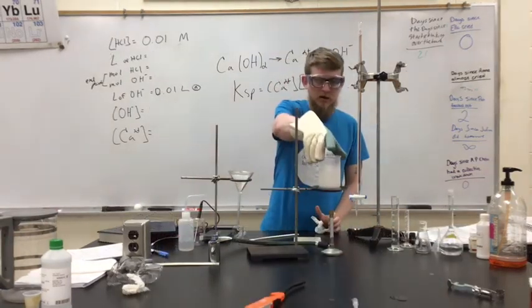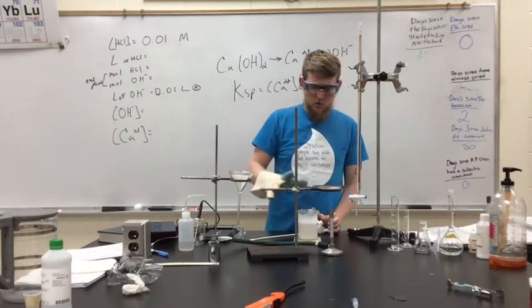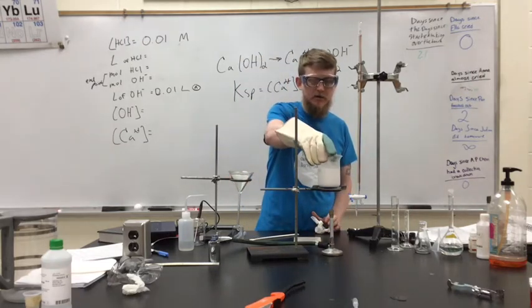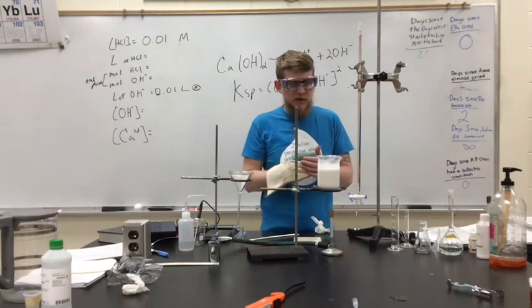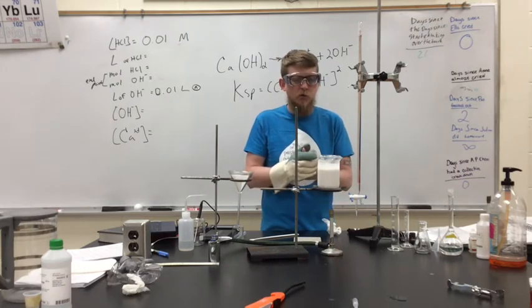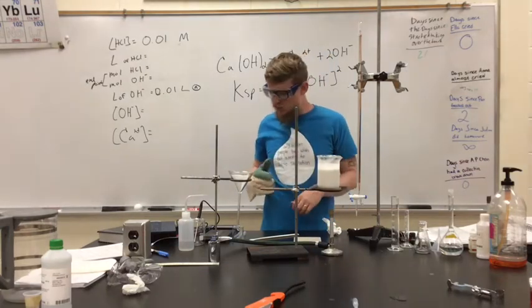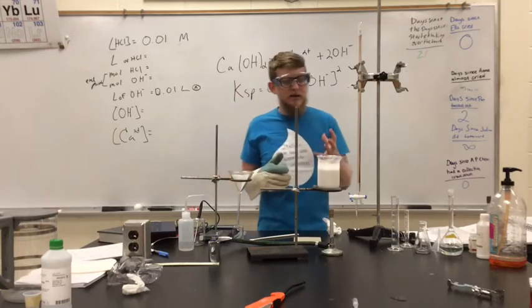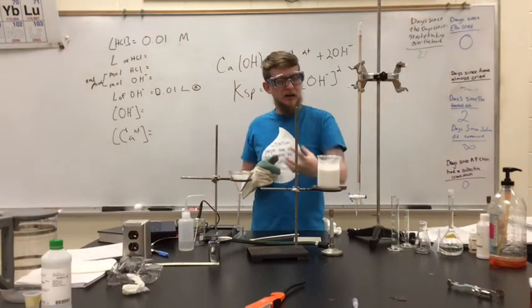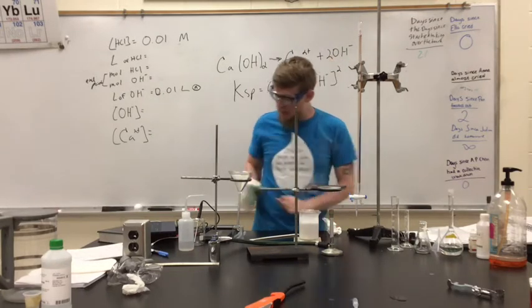This is the second part of our lab here, where we're going to do a temperature dependent measurement now. All right. So this will be in order to calculate delta H and delta S. So this has been boiling here for a little while, right? So it's really hot. And we're going to do this experiment again, but we're going to make sure we do it while the solution is hot. So it's very important to filter this quickly, right? And collect your 10 milliliters that you know the temperature of, and do it like that.